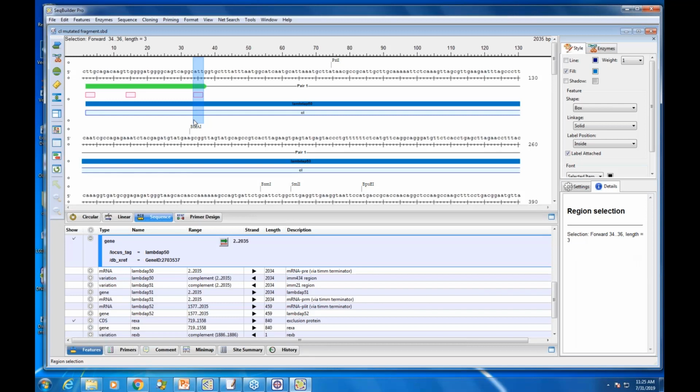And actually, the protein I downloaded and the paper were off by 1 residue, so I might not have grabbed the exact right one. So everything's going to be shifted by 1, but it's close enough for the webinar. So I annotated so I can see what I've done. So I had designed a pair of primers then.